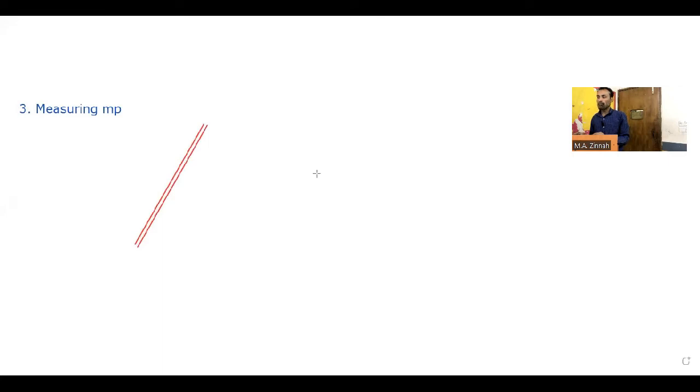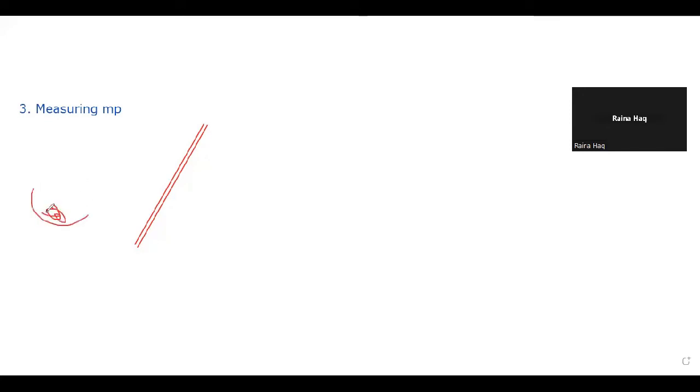This is kind of like what we write in some pen, পেনের ভিতরে শীষ থাকে, দেখেছো তোমরা? আমাদের আগে এরকমই ছিল, এখন কমে গেছে। এই শীষটাকে চেঞ্জ করা যেত, we could replace the শীষ, খালি শেষ হয়ে গেছে, আবার নতুন শীষ কিনে ঢুকাতে পারতাম। ইকোনমিক ছিল, এখন তো এরকম কম। ওকে, still some are there. এরকম কিছু ক্যাপিলারি টিউব আছে, very thin, very narrow. আমরা স্যাম্পলটা পেয়েছি এখানে। OK, that's pure sample. এখন some of the sample to be taken here in the capillary tube, and for this একটা সাইড বন্ধ করে ফেলতে হবে.